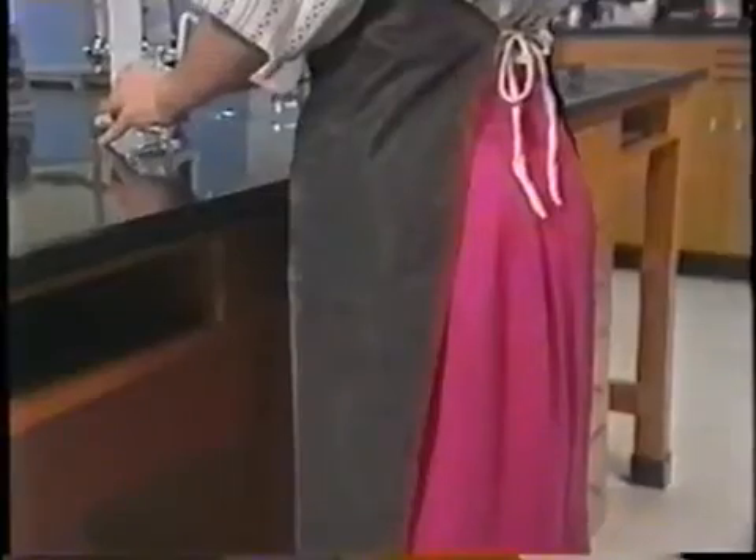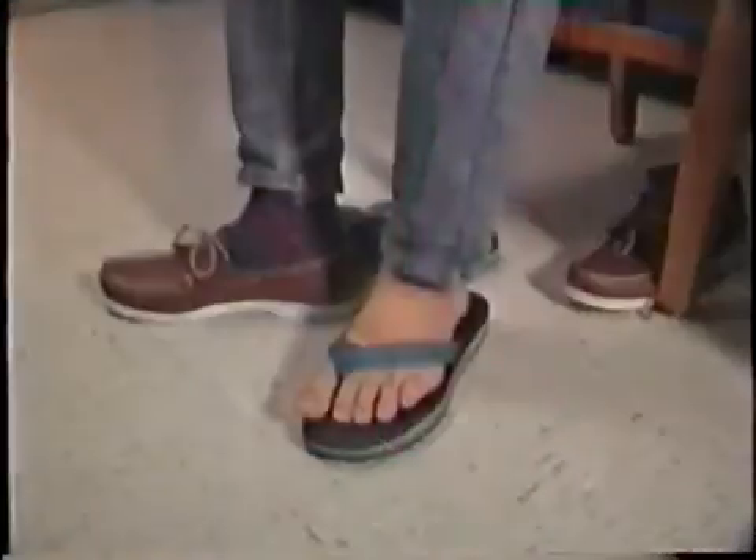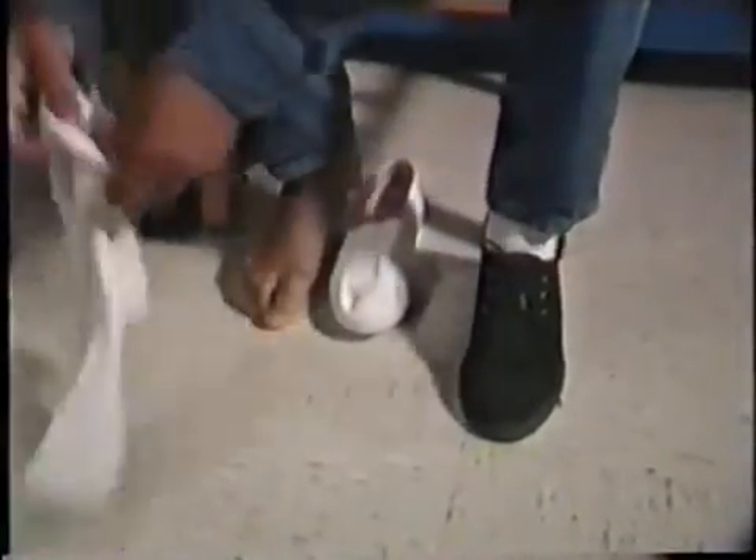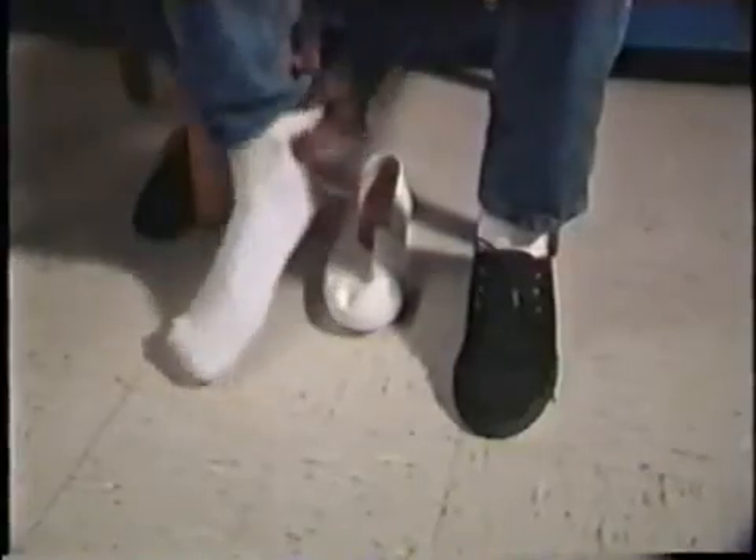Legs are vulnerable to chemical splashes and broken glass if you drop something, so long pants or a long skirt should be worn to protect them. Open shoes can't protect your feet from spills — closed leather shoes are much better. Shoes made of cloth or woven material can absorb spills and hold harmful chemicals against your skin.